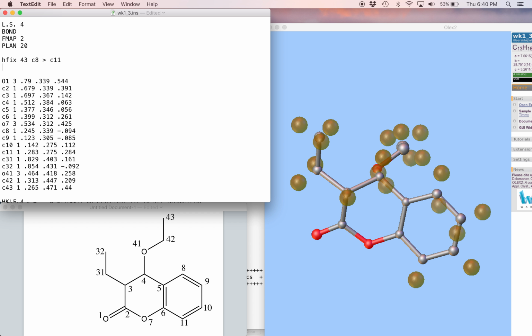HFIX 23 is for a CH2 group. That's going to be C31 and C42.